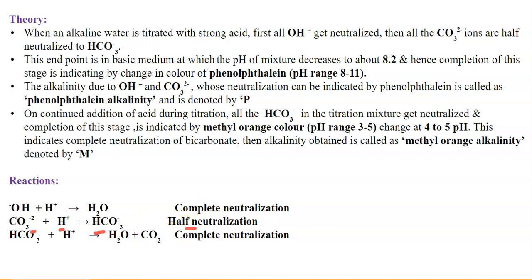And then in the third step, the bicarbonates which we get from carbonate as well as the bicarbonates which were already present in the water sample will react with acid to form H2O plus CO2. That means in this case the complete neutralization has taken place. So this is the reaction which is going to take place.